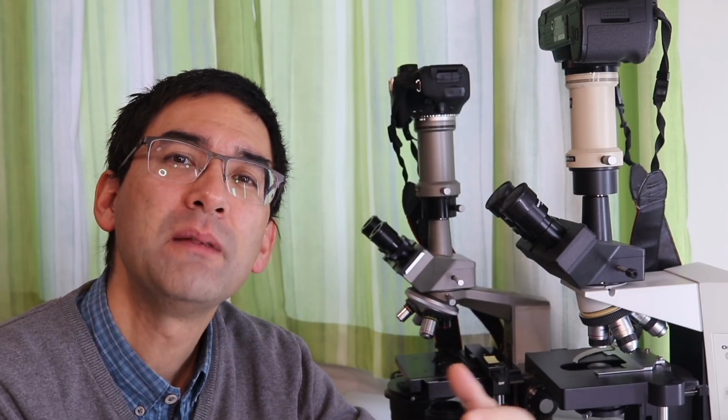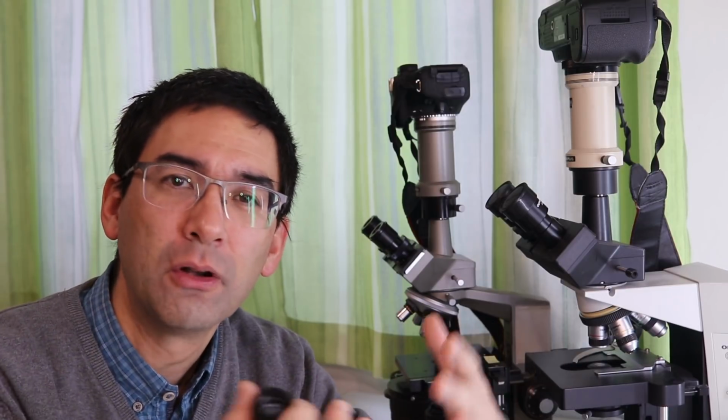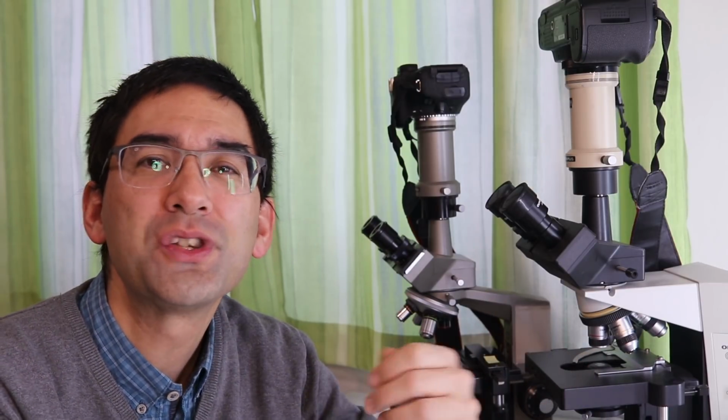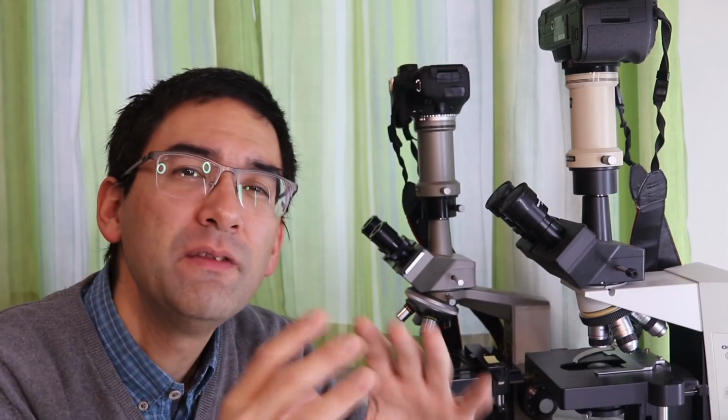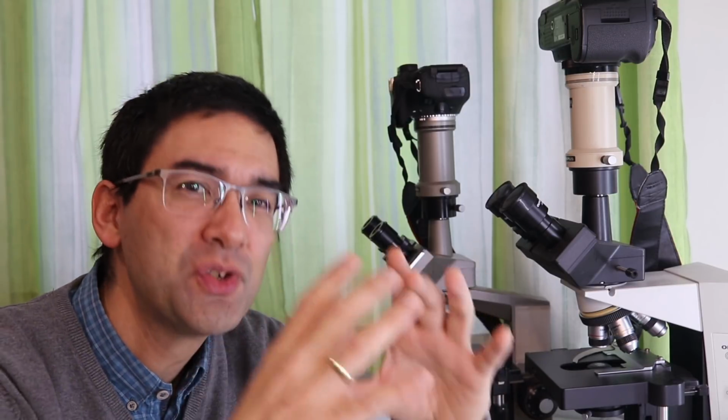But in the research area and also in the educational area, they're not really very common, because even though you can make the object appear larger by adding a stronger eyepiece, you do not really gain anything in resolution. This means it's just going to be larger but also more blurry, so you do not see any more fine details. However, I do admit there might be some specific cases where it's simply more convenient to get a higher magnification, even if it's a little bit more blurry, simply because you see it larger.